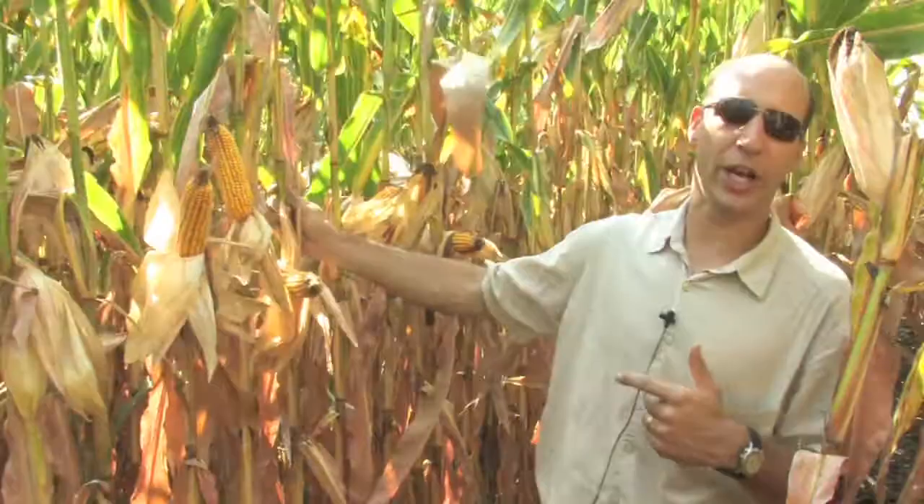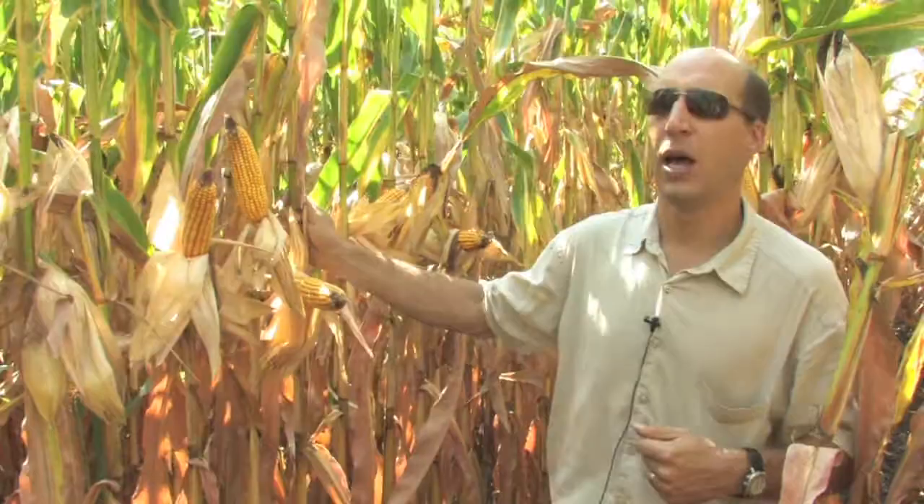So what we're going to do here is a very simple, what's called a gene check, or use a gene check strip to check whether this plant is expressing that Cry1F gene.